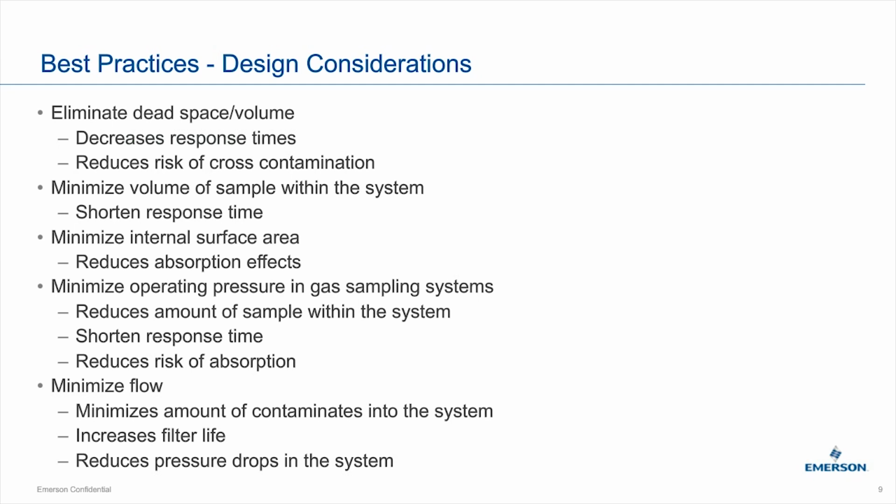If you do that, you end up reducing the filter life. The filters will catch it, but you're going to have huge maintenance. Also, with flow, you worry about the pressure drop. So those are things to consider. On the converse side, if you go too slow, obviously you're going to increase your lag time, because we'll get to that slide, but you'll see flow is the denominator. So if you decrease it, you increase sample lag time. The other problem is that if you have liquids, it's possible to get particle dropout or solids forming. So when we say minimize, it really should be optimized. That would probably be the best word.